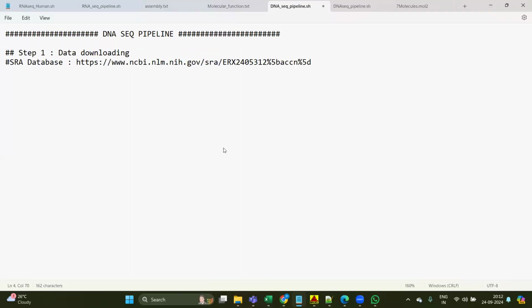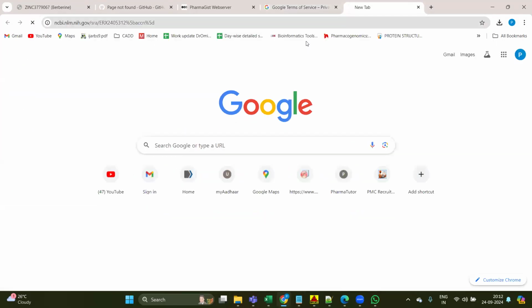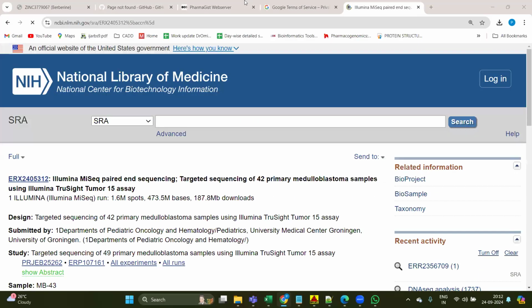Okay. So, yesterday only I have given you some IDs for which we are going to download the data. We have chosen one smaller data just to run the pipeline quickly and easily. So that's why we are having this particular link with us. I have pasted this link yesterday also in the chat box. Here also I'm pasting it because this data we are going to download.